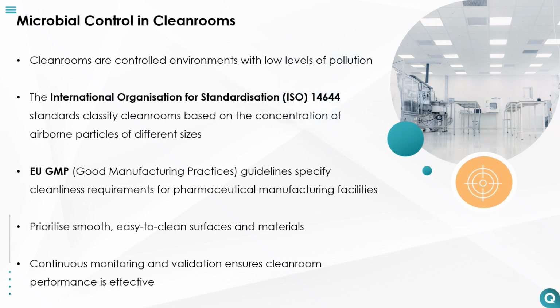Clean rooms are controlled environments designed to minimize microbial contamination. These environments adhere to ISO 14644 standards, which classify clean rooms based on airborne particle concentrations across various size ranges. EU GMP guidelines specifically outline cleanliness requirements for pharmaceutical manufacturing facilities, ensuring stringent microbial control.